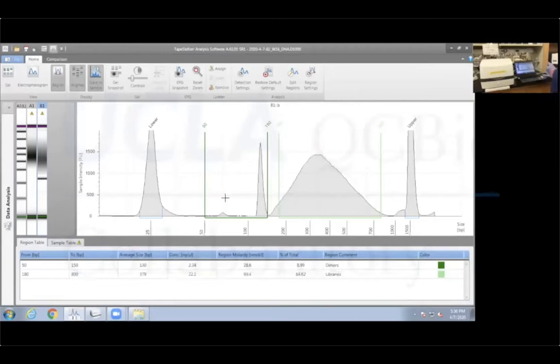How do you do that? You perform an AMPure beads or SPRI beads purification. I usually prefer to do, in this case, a ratio of 1 to 0.8, so 0.8 volumes of the beads. So I usually bring the library up to 50 microliters, and then I add 40 microliters of the AMPure beads. So I have 50, which is 1, and 0.8, which is 40 microliters of beads. And then I perform exactly the same steps that we've seen before.